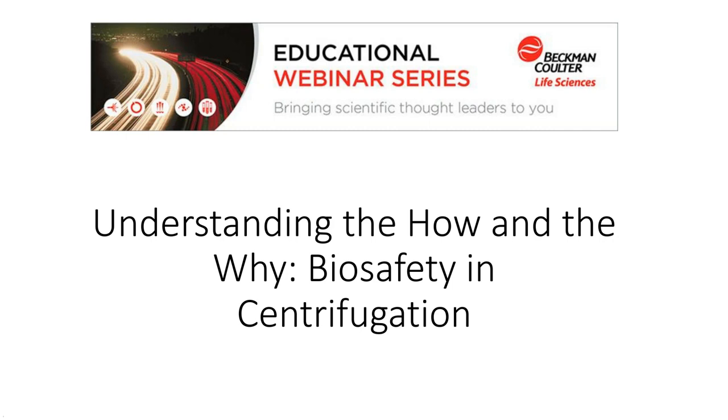Great, thank you. Next question. Regarding balancing loads for swing bucket centrifuge when placing tubes, was the picture shown in your slide, the one on the left, an okay loading? So this is when I'm really sorry that I can't point to things at this moment.